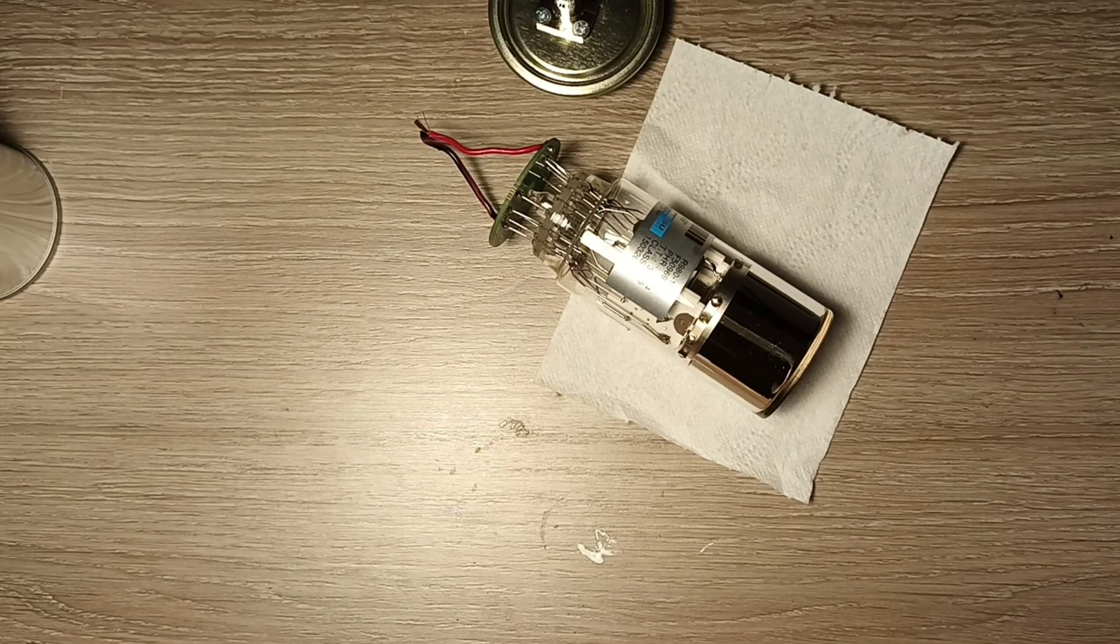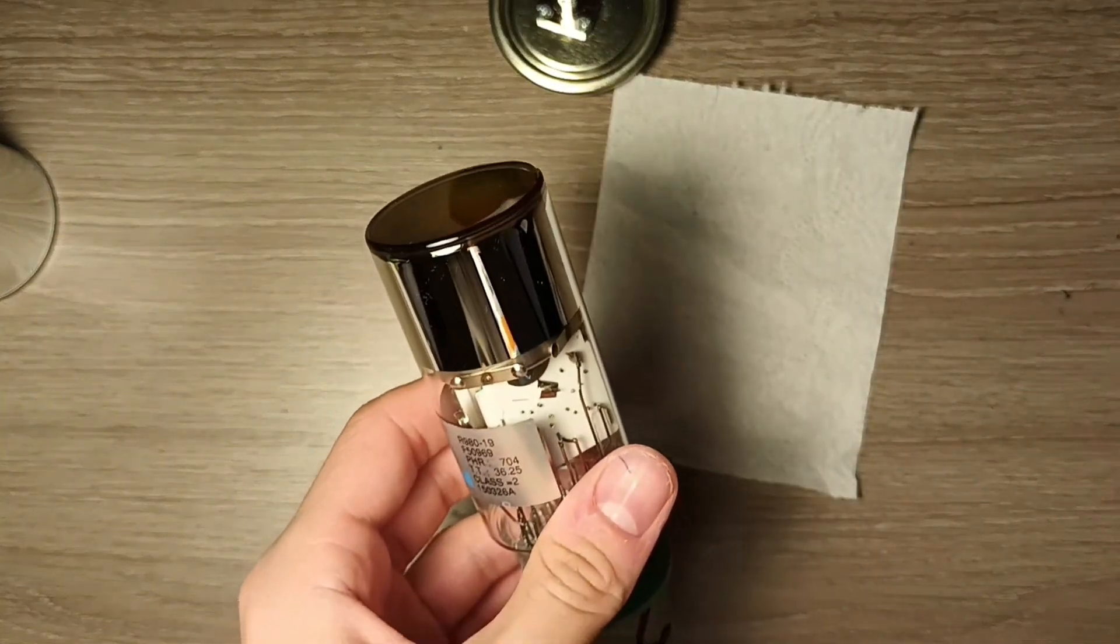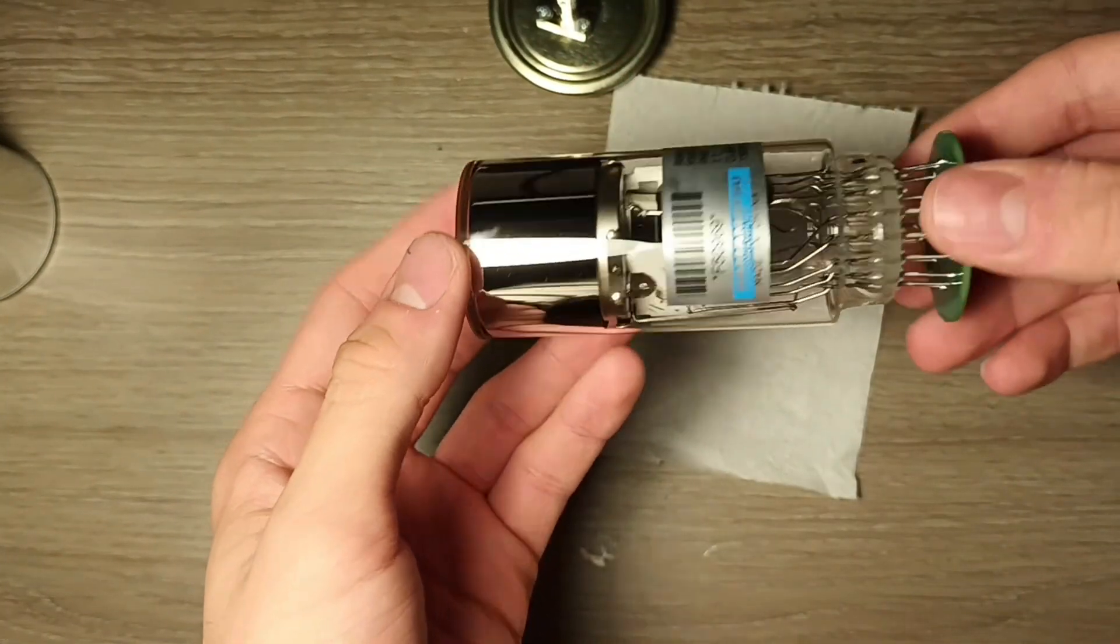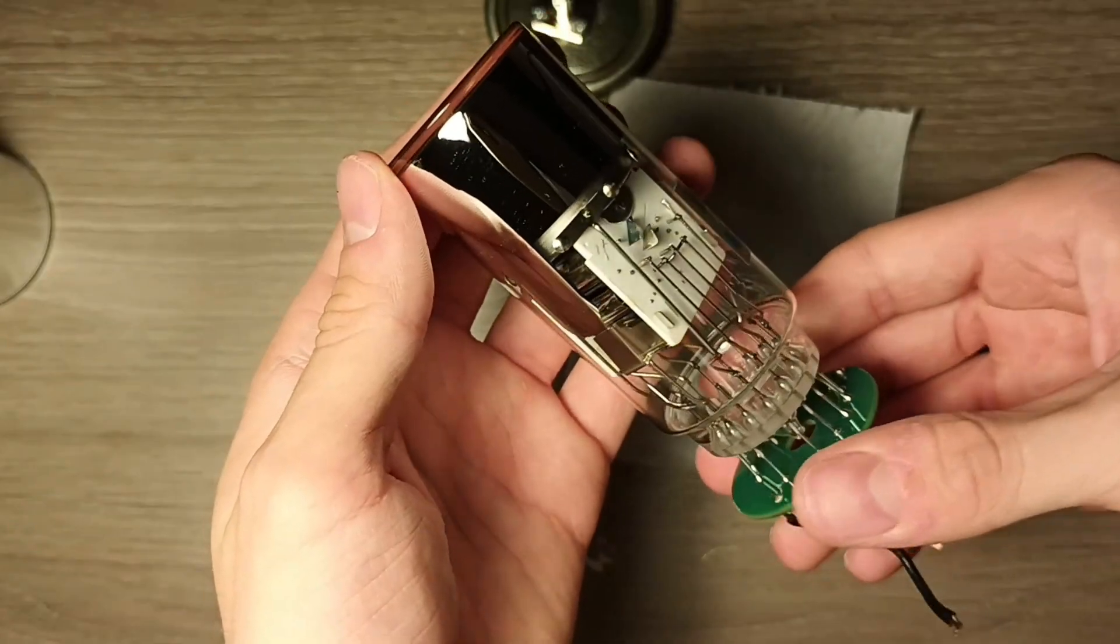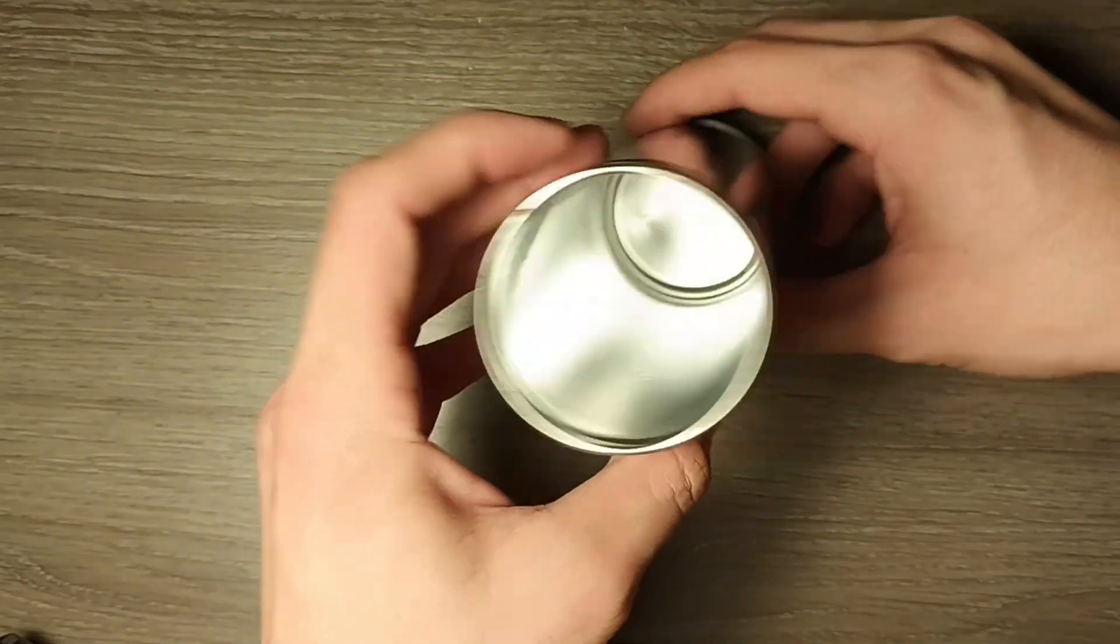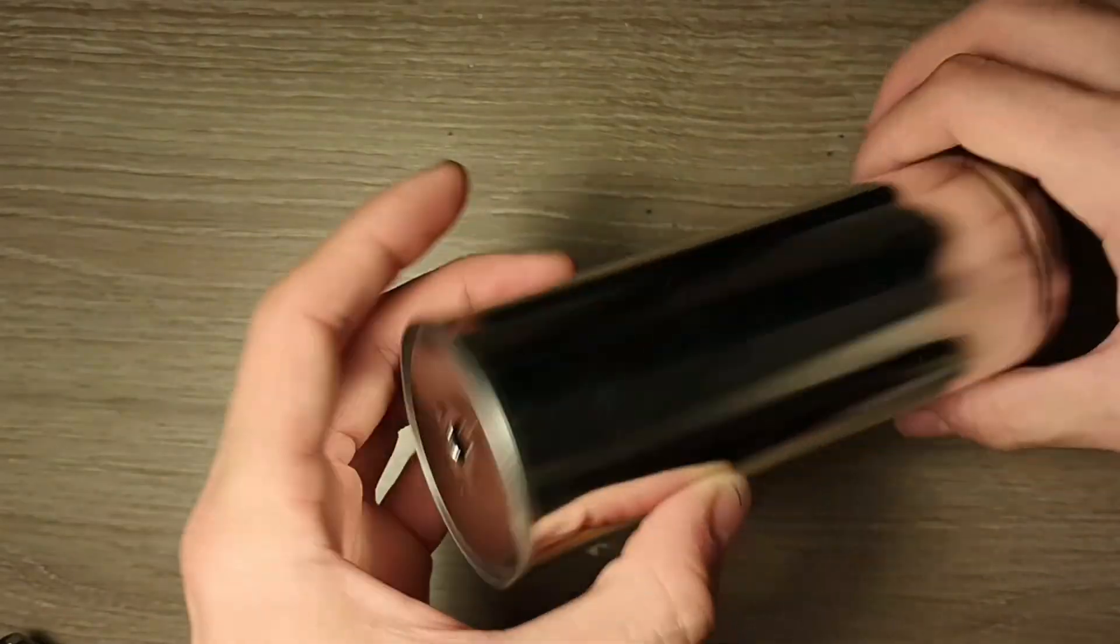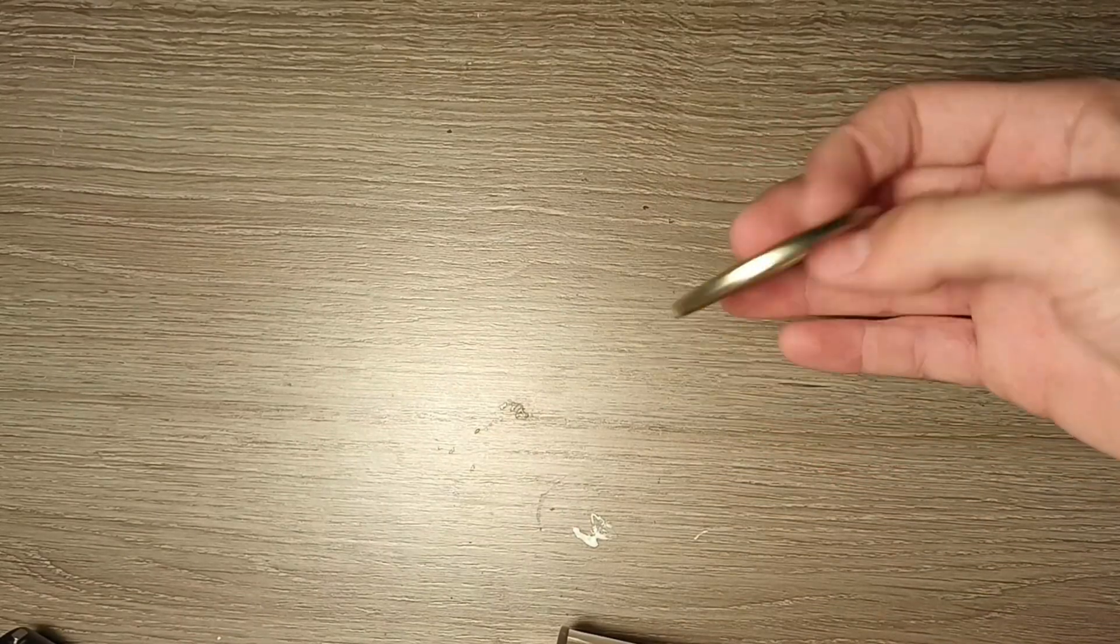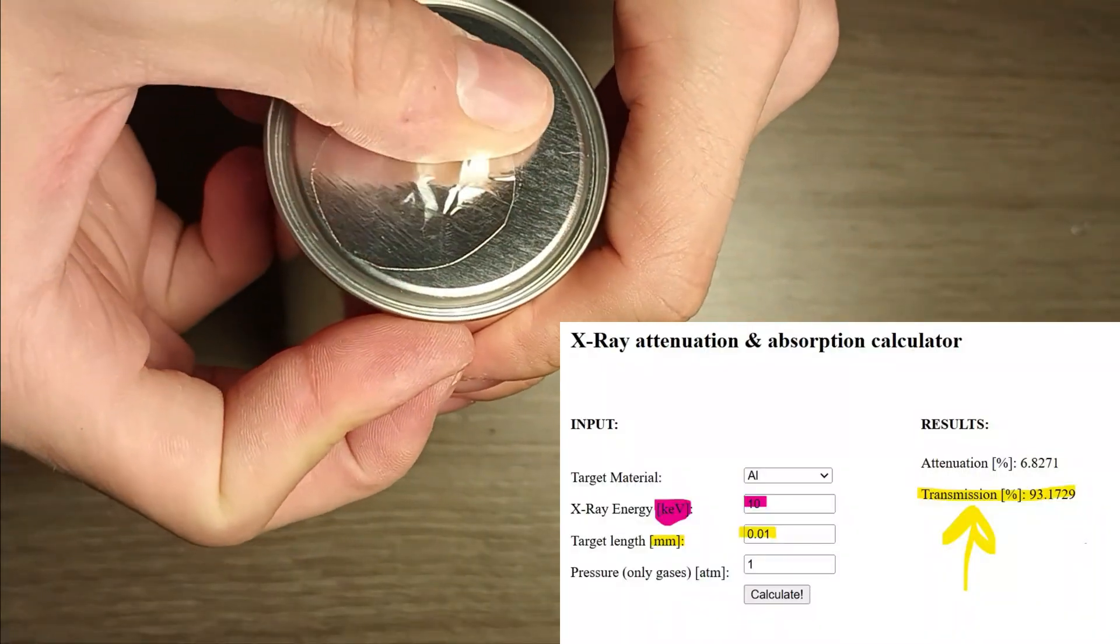First of all we need a photomultiplier tube. This one is the one I'm using and it's a Hamamatsu 980. It has a high impedance voltage divider totaling to 120 megaohm. The photomultiplier tube needs to be inside an enclosure and in this case I'm using a metal can to which I made two holes, one for the incoming X-ray and one for the cable output. If we want to see very low X-rays this is fundamental to use an extremely transparent window to the energy that we are interested, and for this reason I'm gonna use aluminum tape.